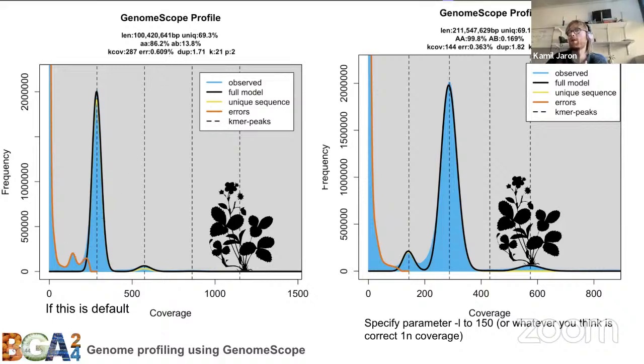So it's just simply thought that this one is more likely than this one. But you can always manipulate GenomeScope. So you can, for example, give it a k-mer prior, which mostly steers the heuristic algorithm to properly explore the space around the coverage. So it's not really bending the statistics, it's just giving it the right direction towards the genome.